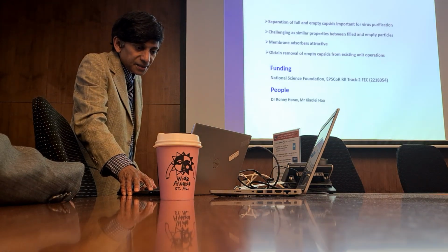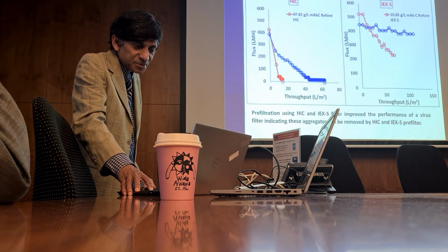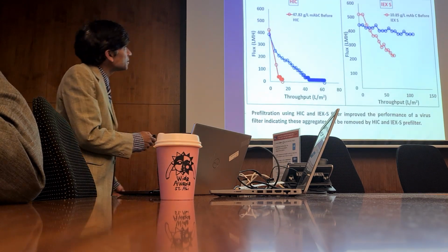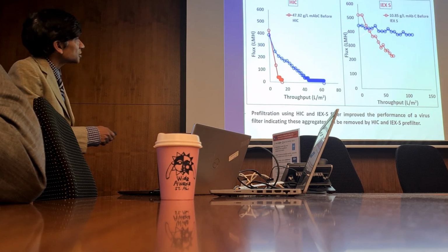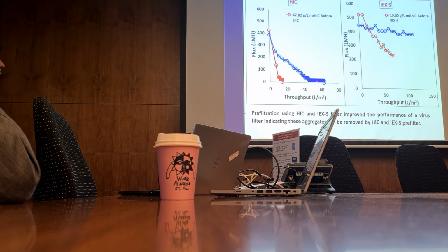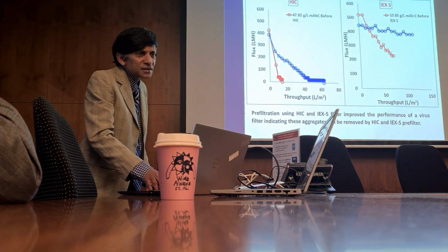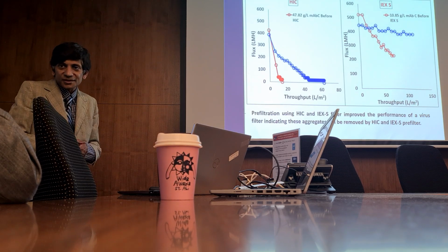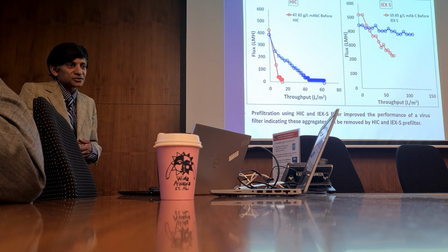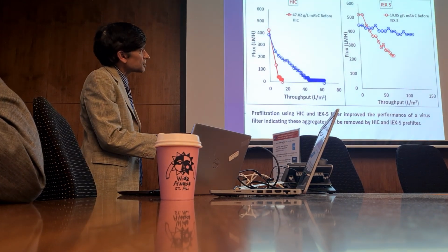Going back here, right at the very start, I had this slide. I didn't talk about it that much, but we used two different membranes: this one here, HIC, and ion exchange. HIC does help, though in this case it didn't help quite as much as ion exchange. The idea of hydrophobic interaction is that you use a membrane that typically has long-chain hydrocarbons on it to absorb more hydrophobic components. That did help, but in this case it was ion exchange that was more successful.